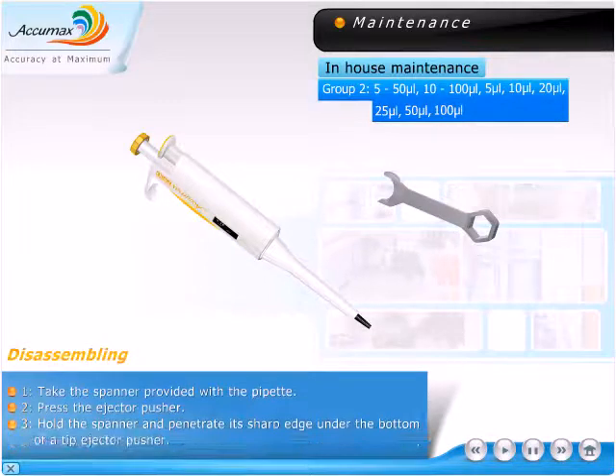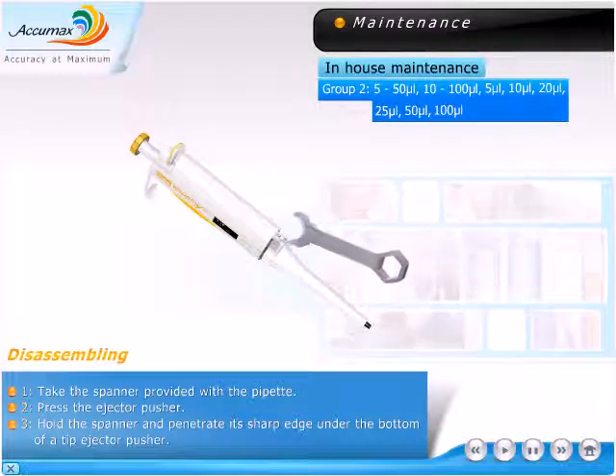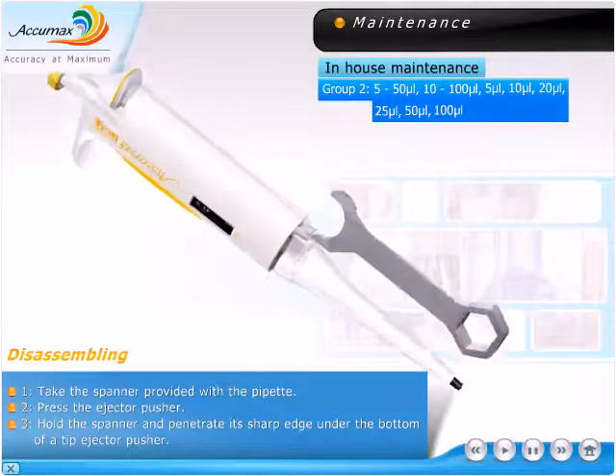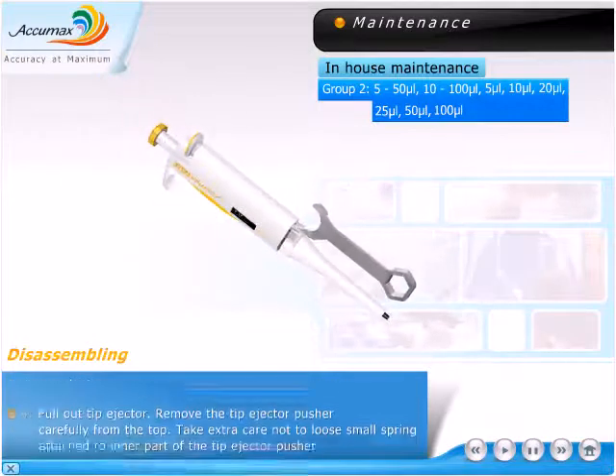Disassembling. Take the spanner provided with the pipette. Press the ejector pusher, hold the spanner, and penetrate its sharp edge under the bottom of the tip ejector pusher. Pull out the tip ejector.